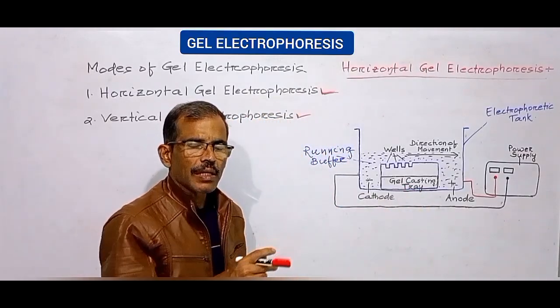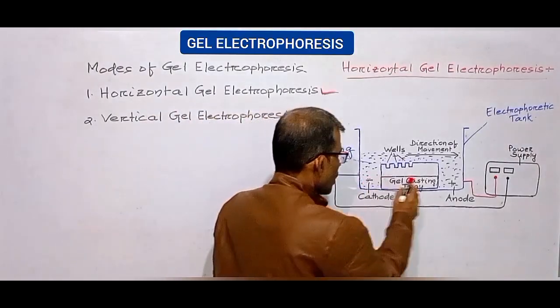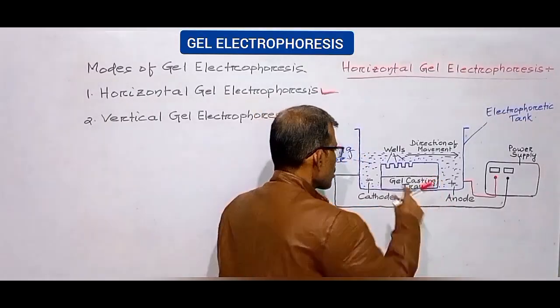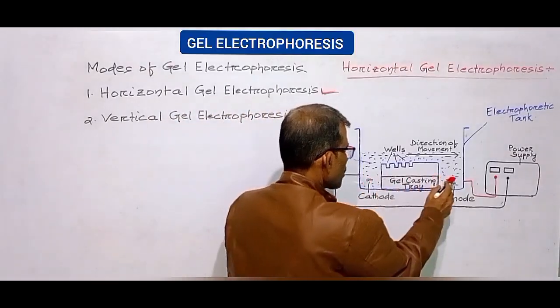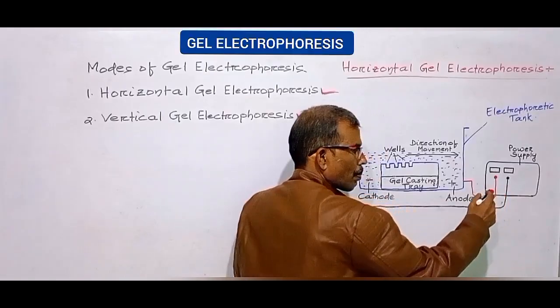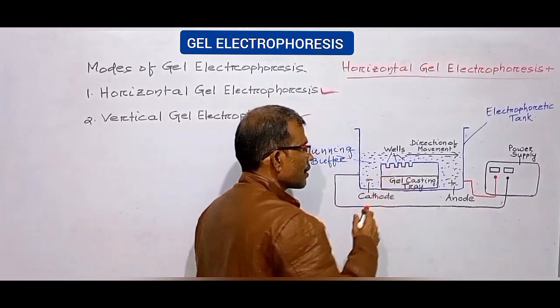In this technique, electrophoresis is performed in a continuous fashion with both electrodes and the gel cassette remaining submerged within the running buffer. Two platinum electrodes placed at both ends are connected to an external power supply from a power pack that supplies the stabilized direct current.